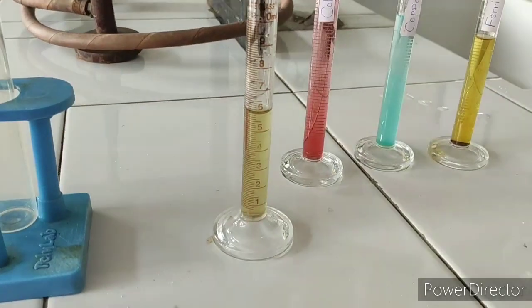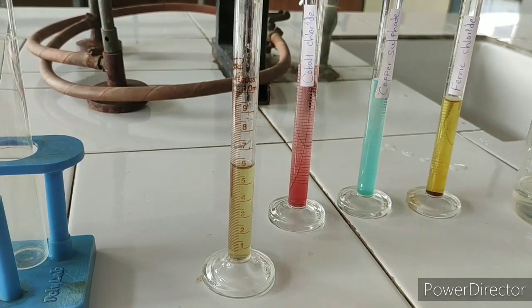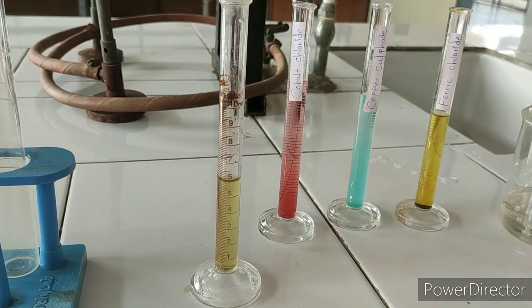Now the combined volume should be 6 ml. We add purified water to bring the quantity up to 10 ml — that is, 4 ml of purified water is added.